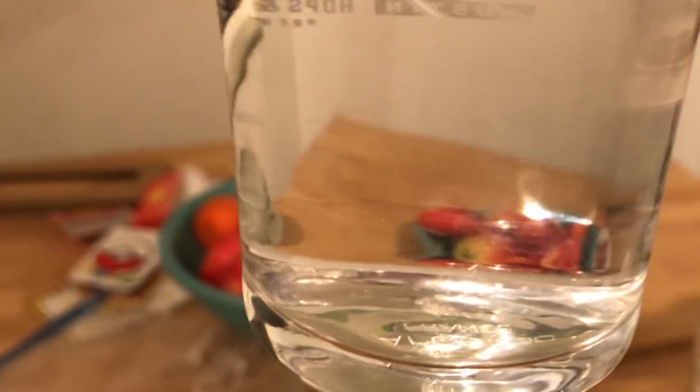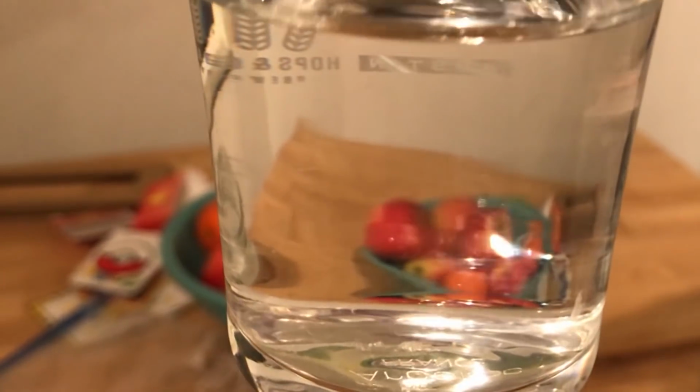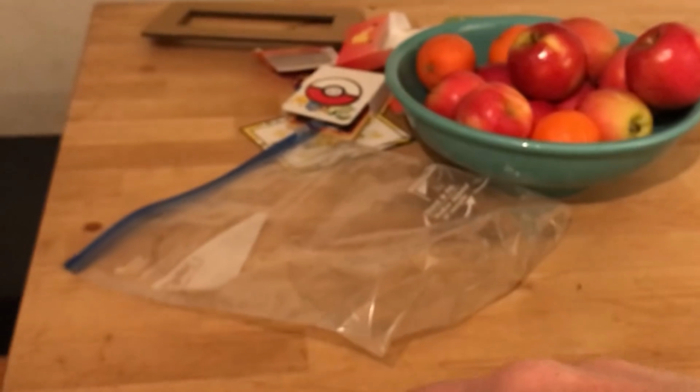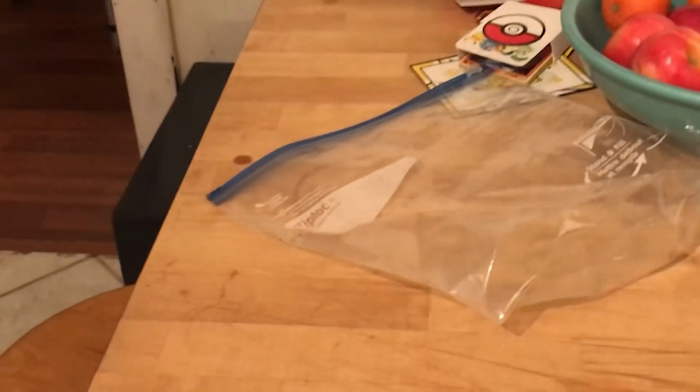So sucrose, just like glucose or any other sugar, is a molecular compound compared to the ionic compounds that we looked at a moment ago. So this is a soluble molecular compound. This isn't to say that all molecular compounds are soluble, but this one in particular is. Okay, that's sufficient for what we're looking for.